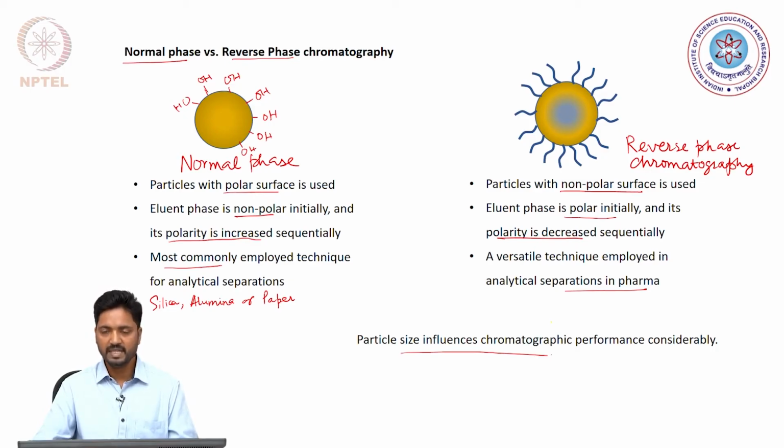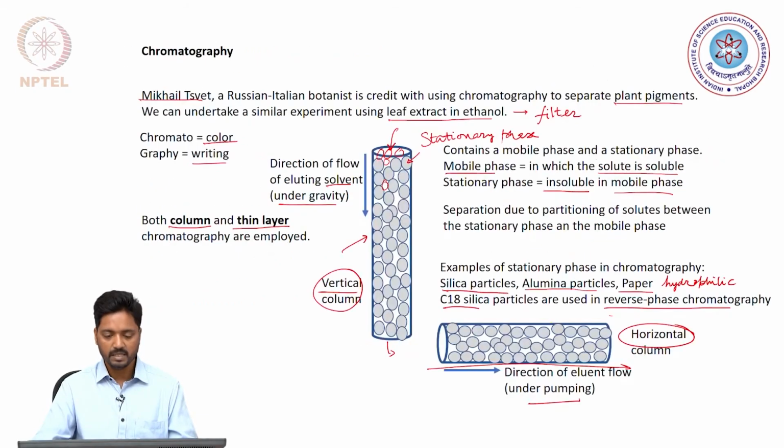So, we have already realized that in the chromatographic separation we have the analyte partitioning between the stationary phase and the mobile phase, and the analyte usually adsorbs onto the stationary phase, and that becomes a way to achieve the separation of the analytes. Now, as we reduce the particle size, we increase the surface area of our particles.